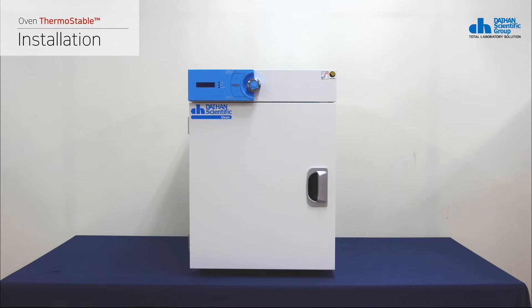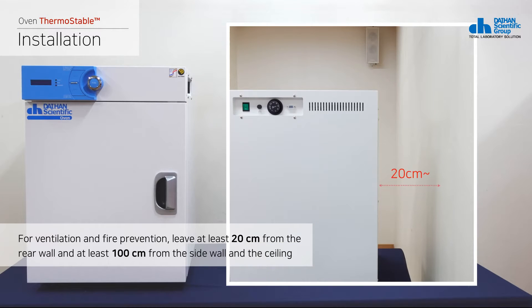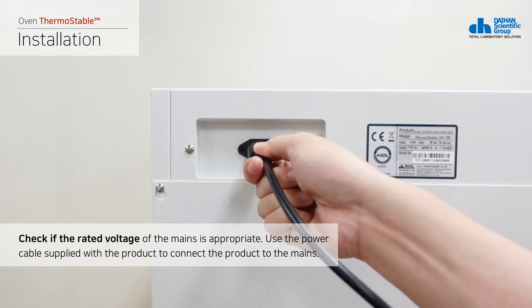Place the drying oven on a hard and flat surface. For ventilation and fire prevention, leave at least 20 cm from the rear wall and at least 100 cm from the side wall and the ceiling. Check if the rated voltage of the mains is appropriate.